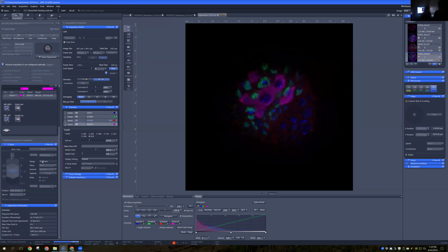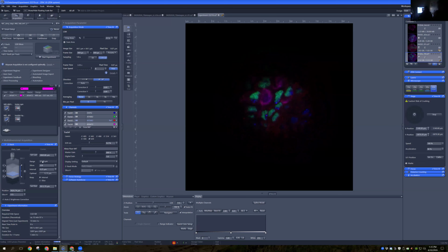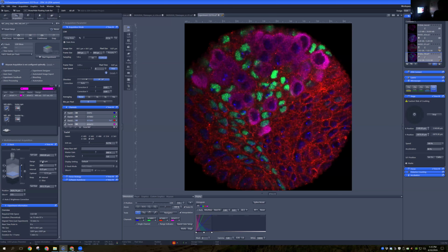Rhea, it's so cool to hear that there's another Drosophila researcher. Yeah, I love it. Are there any other comments or questions from students? Even if you are not a Drosophila ovary researcher, we would love to hear anything you have to say.